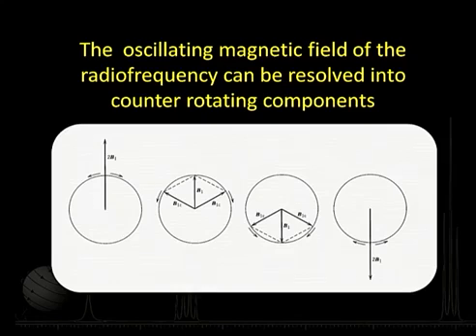In order to understand how that happens, we have to see that this radio frequency, this oscillatory field, can in fact be seen as made up of two counter rotating components. That means this oscillatory field can be thought of as made up of two rotatory fields. Let us understand this. Suppose I have a magnetic vector of the EM radiation. When talking about oscillation, this magnetic vector decreases, decreases, comes down, becomes negative, and then it oscillates like this. That is what we are trying to look at.